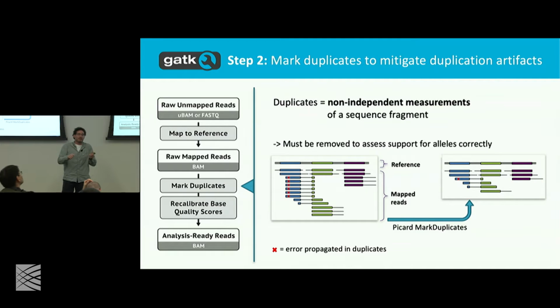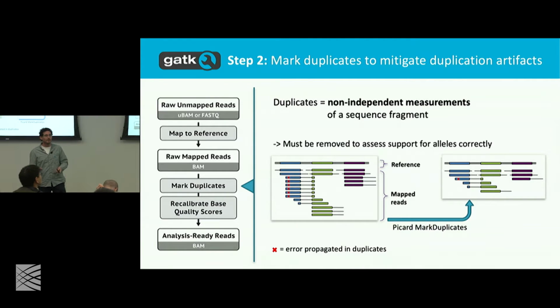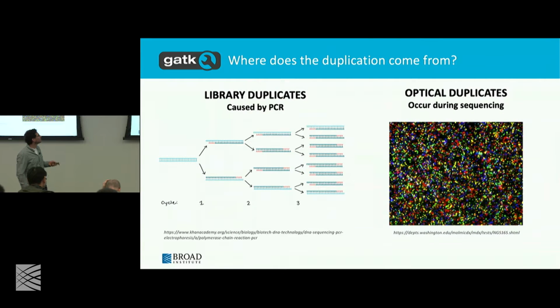So then we're going to have to start having knobs and dials to say, oh, well, if it's just 2 bases that are different, we don't do that. We let the aligner decide. If it aligns in the same place, then it's a duplicate. If it does not align in the same place, then it's not a duplicate. That's basically the idea. What about the soft clip? Good point. So we'll get to that in a second.